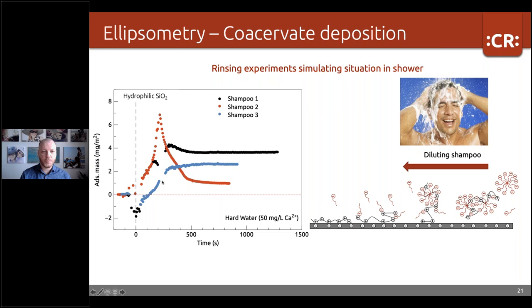And again, we start with a sort of pure, well, it's not a full shampoo formulation, it's slightly diluted already here, but it's before it starts to deposit. And then at time zero, we start to rinse, so diluting the formulation in the cuvette. And then we can see that these three shampoo formulations behave very differently.